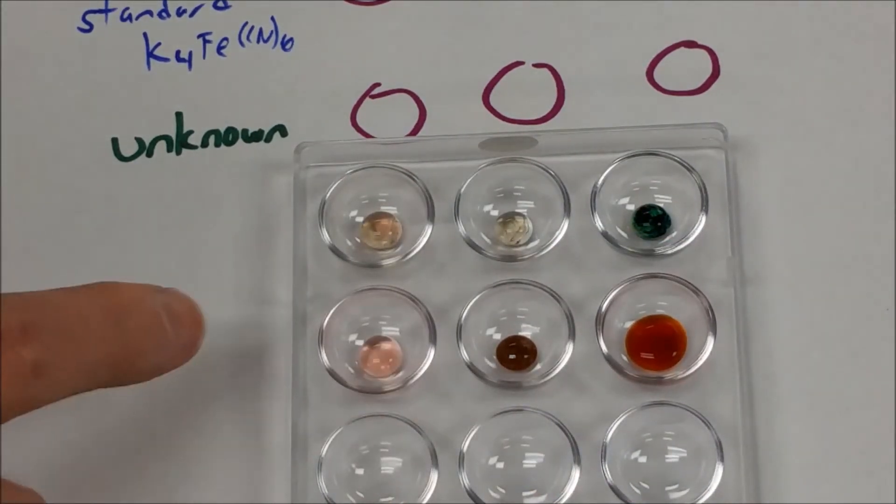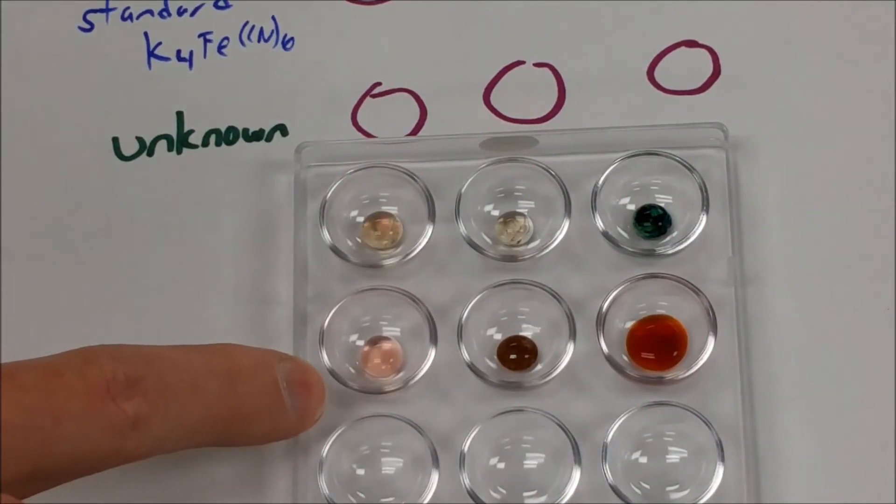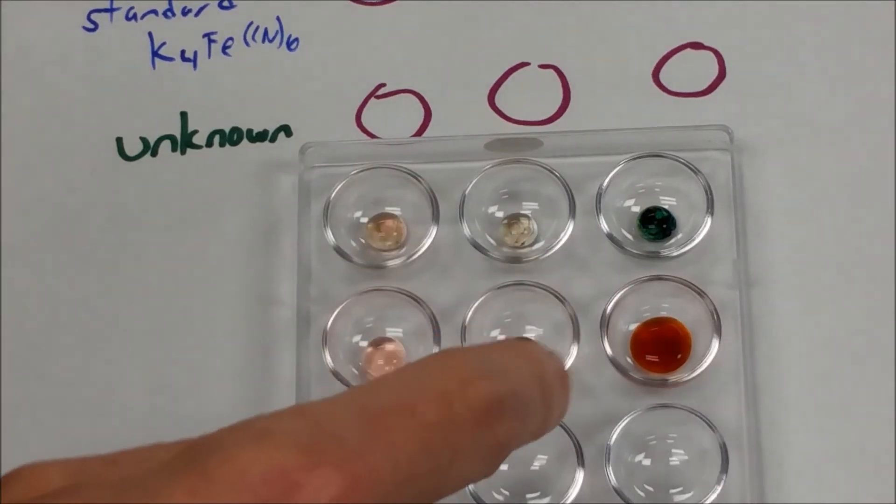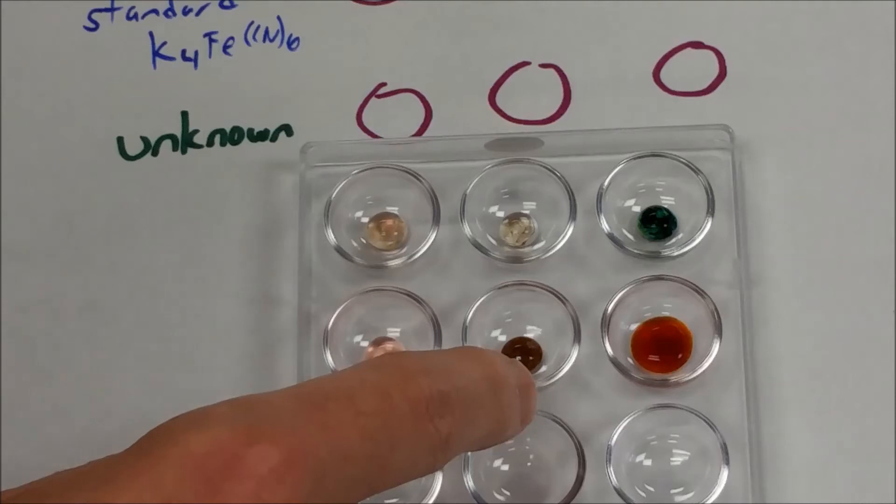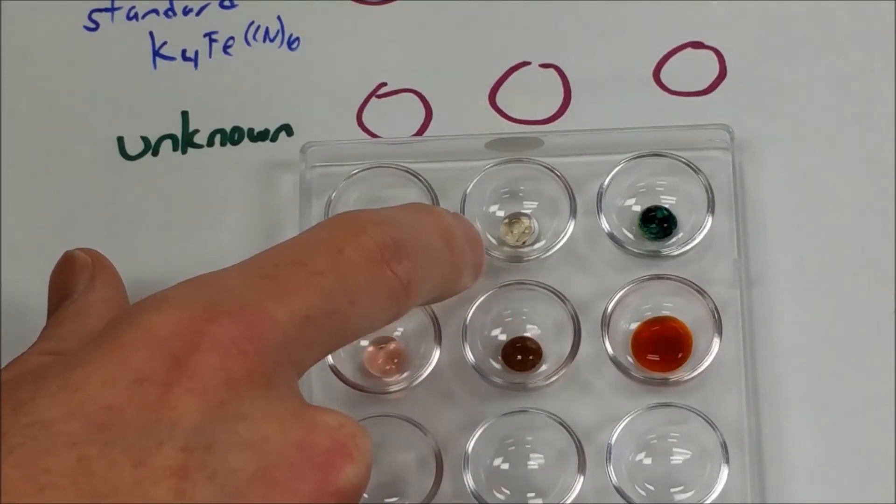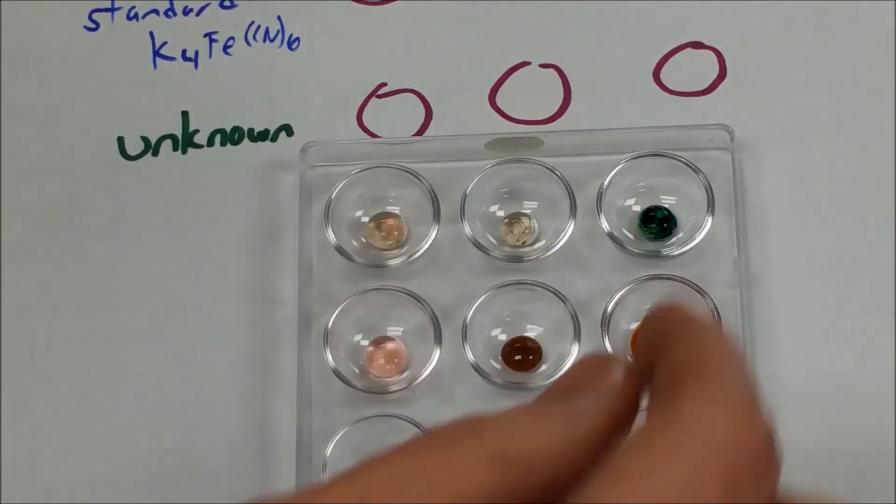But they're clearly different between each one. This one is just kind of staying the pink color, and this one's formed some kind of precipitate that's removed the color. This one has kind of a brownish color to it, and this one we've got some kind of fibrous red stuff, and then it's kind of like a pale cream colored drop.